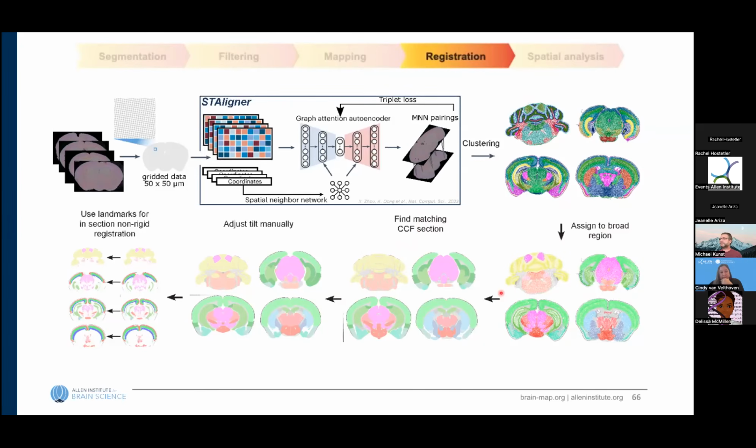And it does a decent job, but it's not perfect. You can see clearly there are some regions that are not being properly captured. Like we clearly didn't have the inferior colliculus found in here. The pontine gray is underestimated.